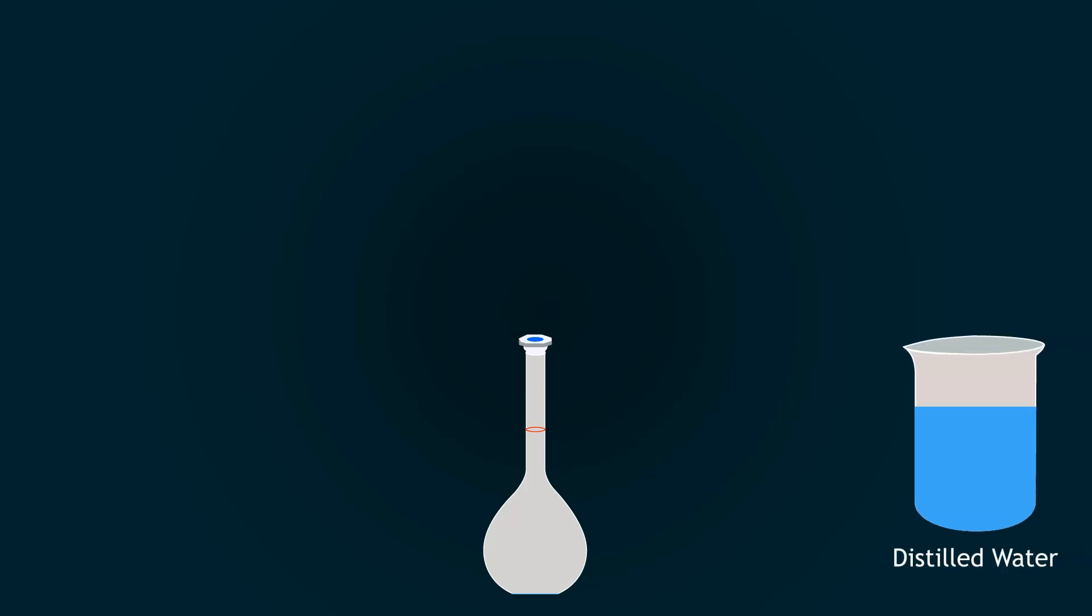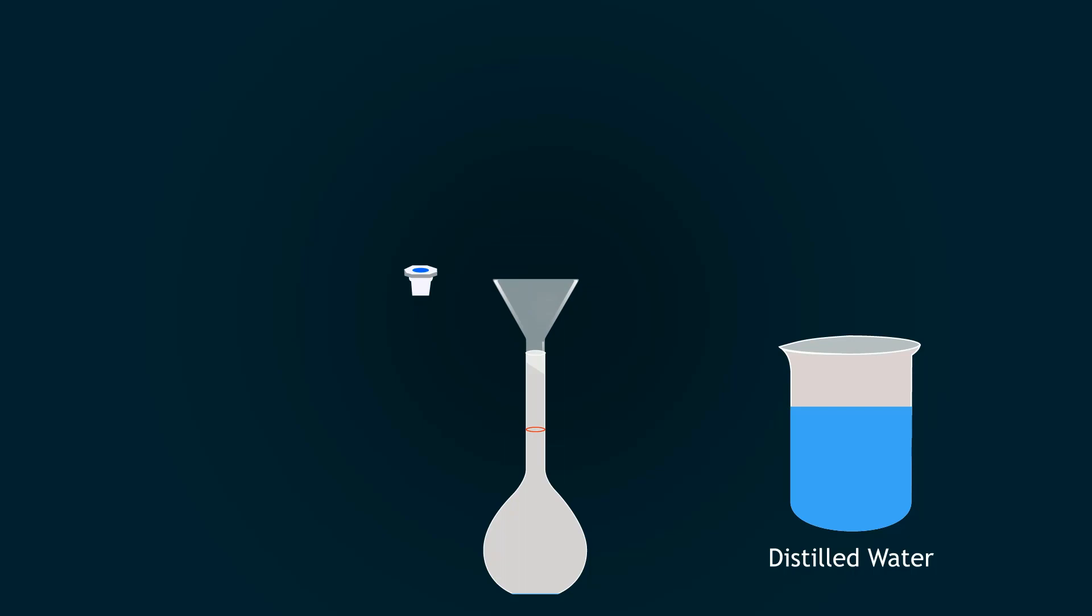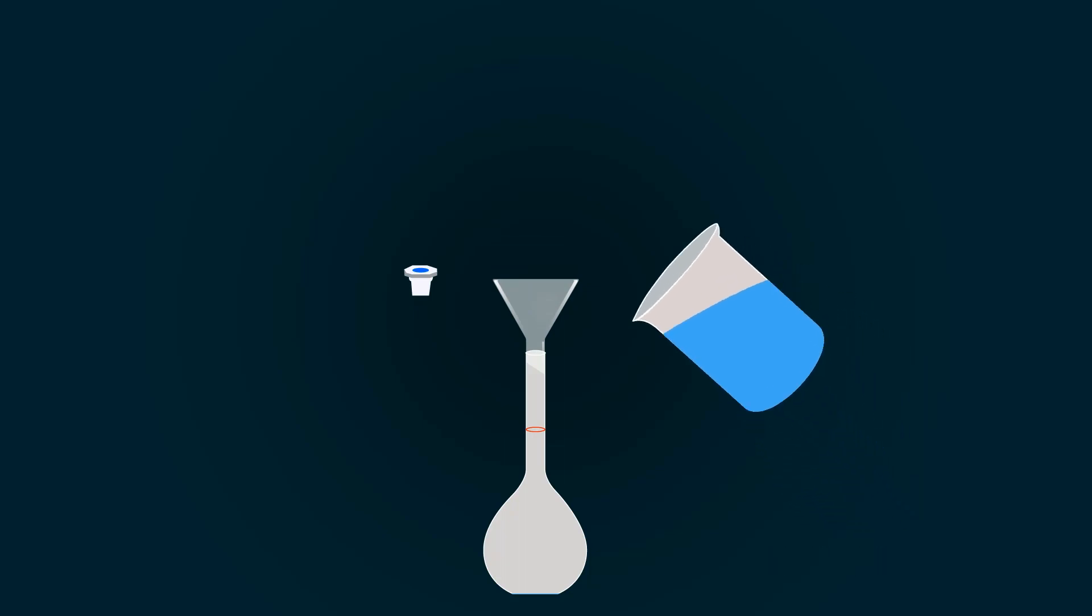First of all, you will get a volumetric flask and add some distilled water into it with the help of a funnel. Do not add HCl directly into the flask, this may damage yourself and the flask.